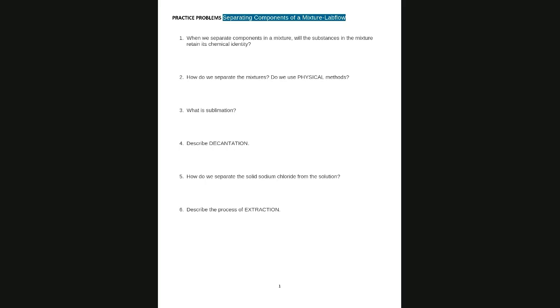I think it's a separation of two insolubles where you... Close. Remember that when we have decantation, it has the same purpose as when you filtrate. Basically, you separate a liquid from a solid.